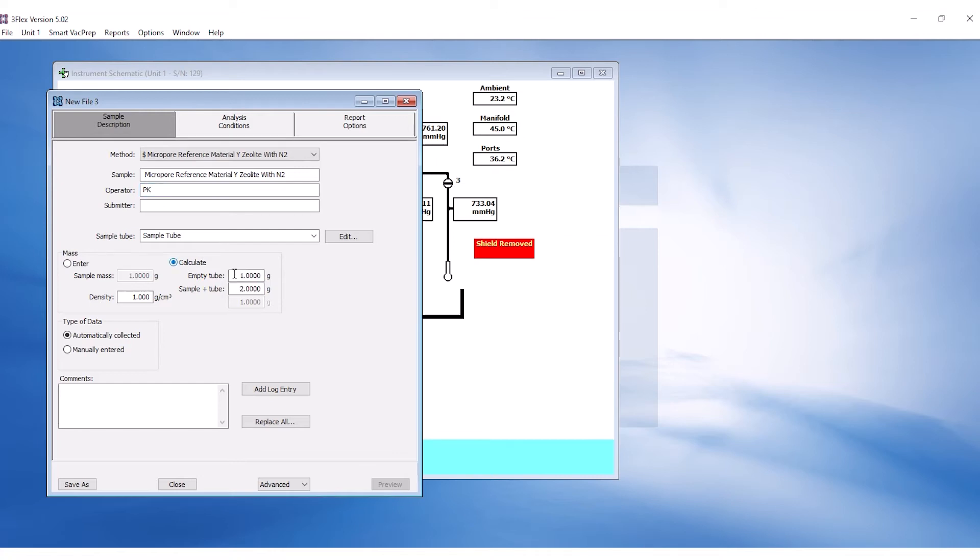The before degas mass can be entered for sample plus tube mass when creating the sample file, but ensure to change the sample plus tube mass after analysis after re-weighing at the end of the experiment.